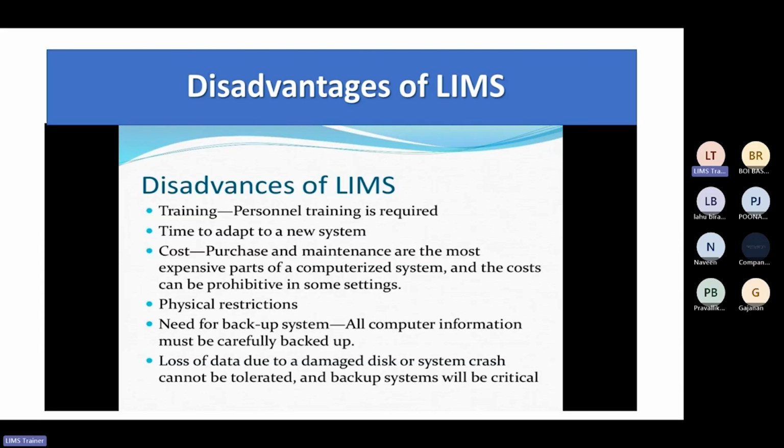Then there will be some time gap, like to adapt to the new system, time will be required. Okay. So suppose you implemented LIMS software into a laboratory. For smooth operation of that laboratory, it will take some time. Because all the working persons have to understand how the software is responding, and how they are generating the different tests and different reports. So to get that flow, it will take some time.